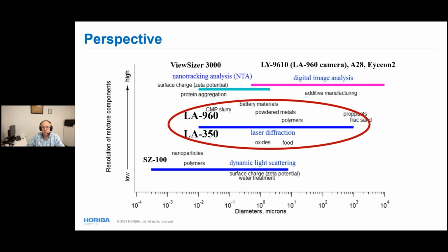But back to an overall introduction, and I always like to give a little perspective. Particle characterization is a broad field, with a number of different analytical techniques. I like this chart where I show particle diameter along the bottom, and resolution of mixture components along the vertical axis. Laser diffraction, which is the topic of today's talk, covers sizes ranging from tens of nanometers up to about a millimeter or more.